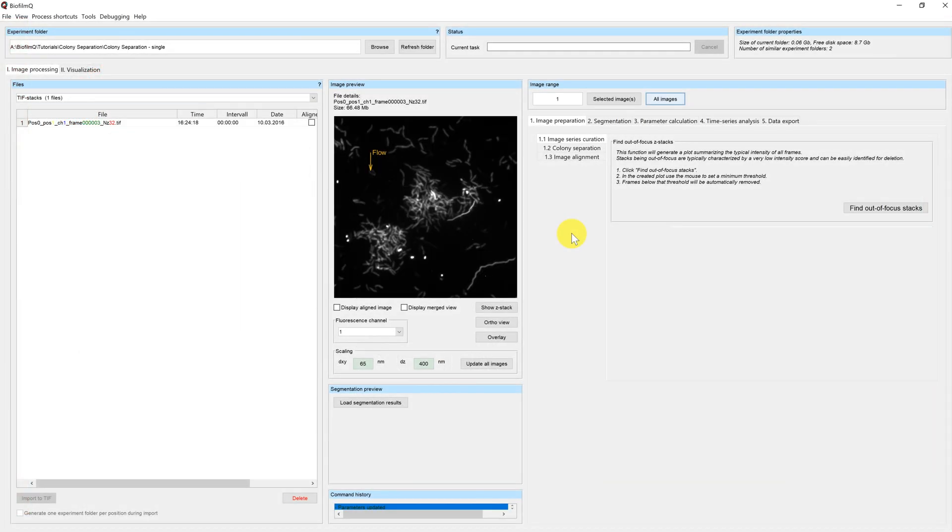Welcome to this tutorial on Biofilm-Q. My name is Eric and today we will learn how to separate two microcolonies in the same microscope image.